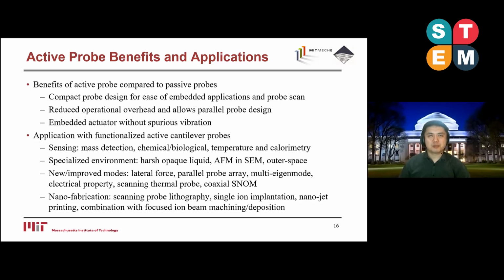First, the compact probe design allows easy probe scan configuration and embedded applications in confined space. It reduces operational overhead for probe laser alignment and allows parallel probe design. The embedded actuator can also avoid structural resonance, as in the piezoacoustic case. And also a number of applications are enabled for the functionalized active cantilever probes.